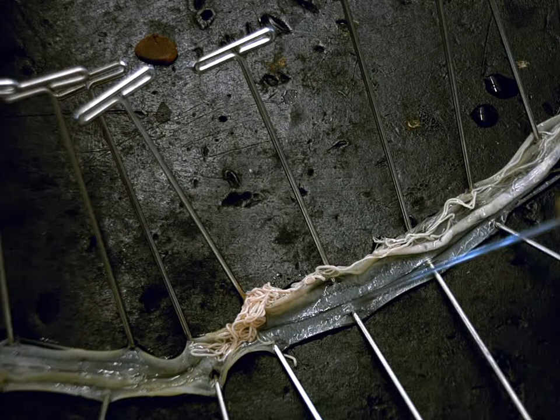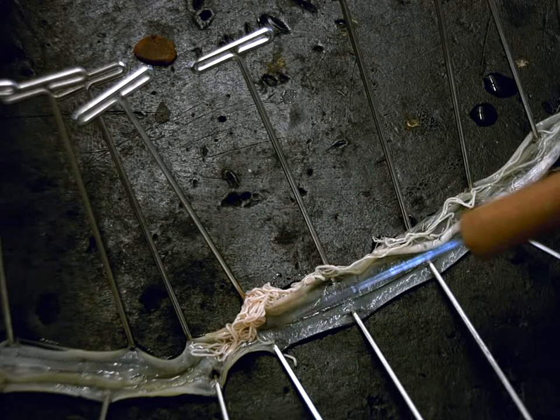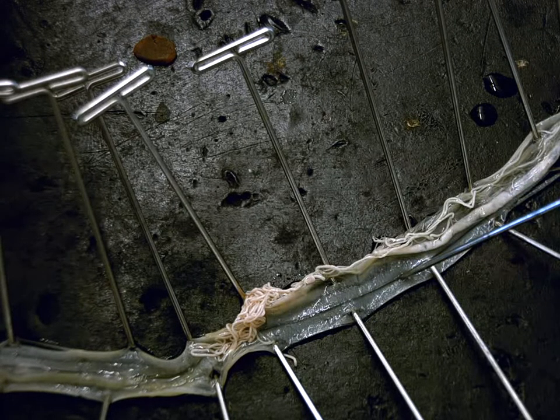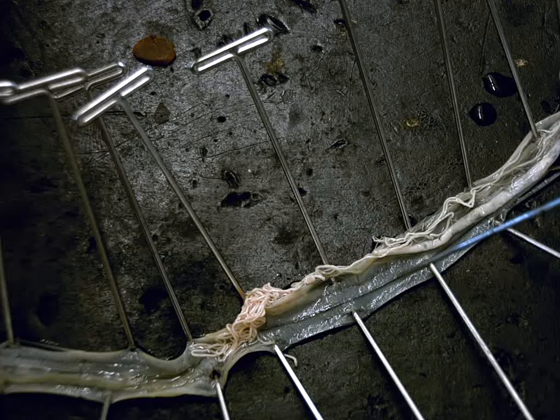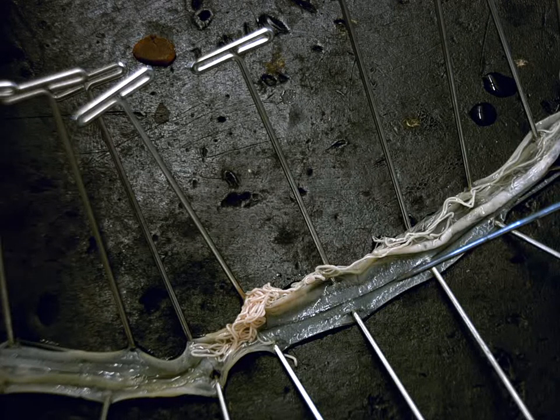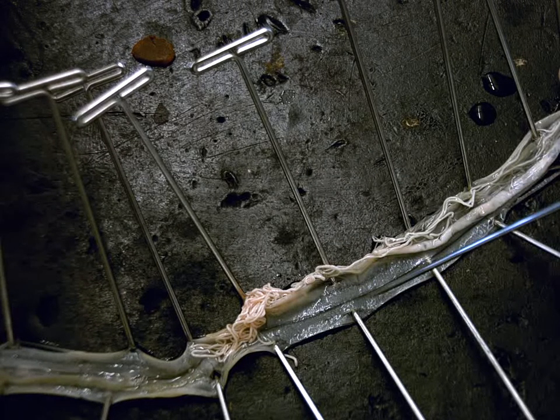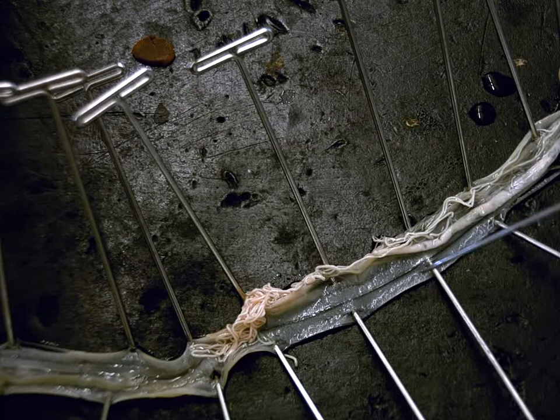I can see this dark line built into the wall of the worm. And this dark line in the wall of the worm is the excretory canal, which is also called the lateral canal or lateral lines. And it's pretty much a tube where urine flows until it can go out of the body.